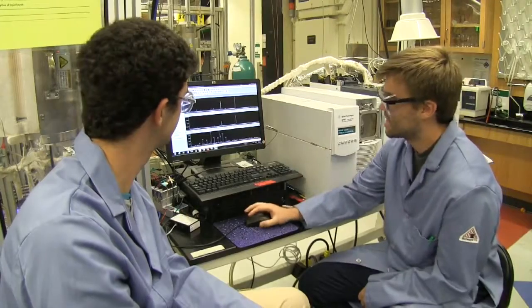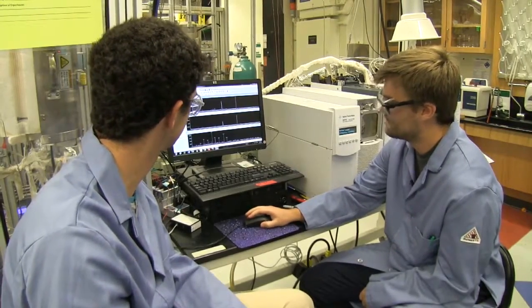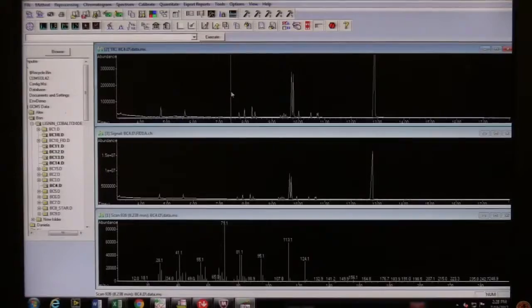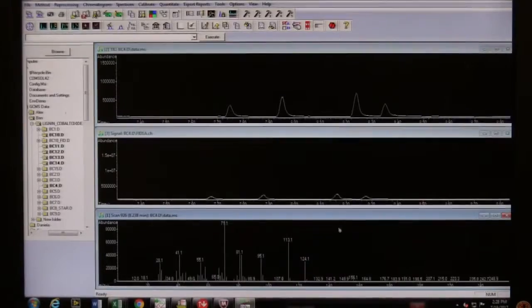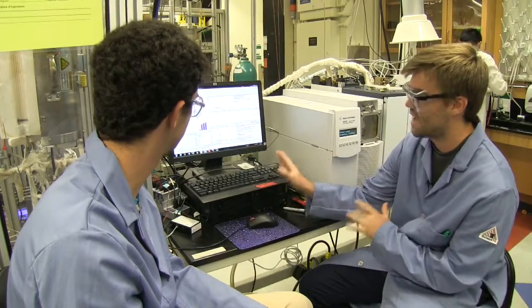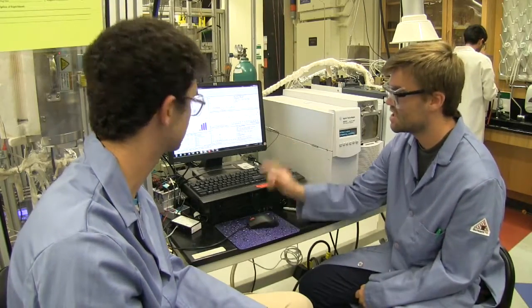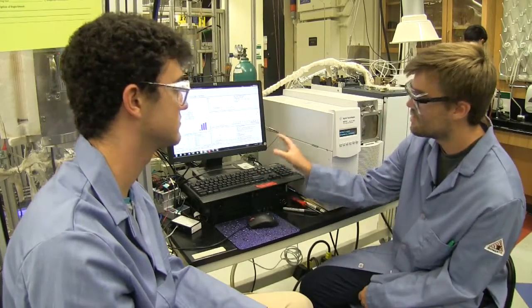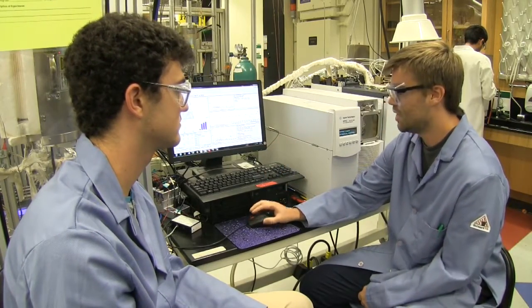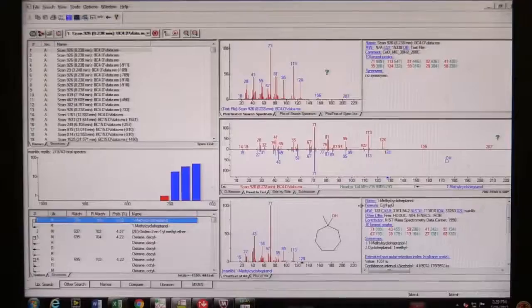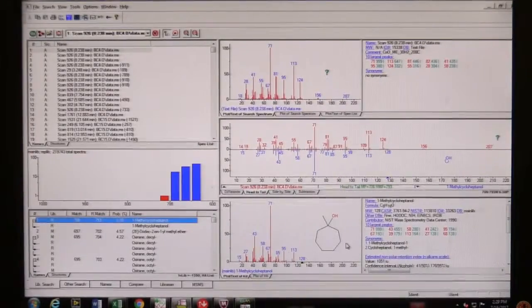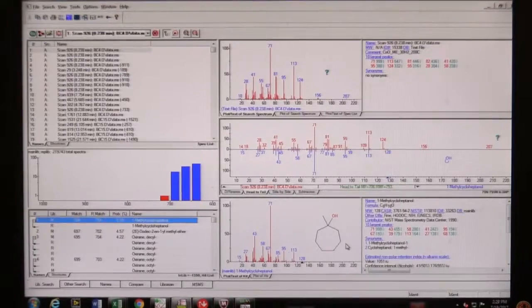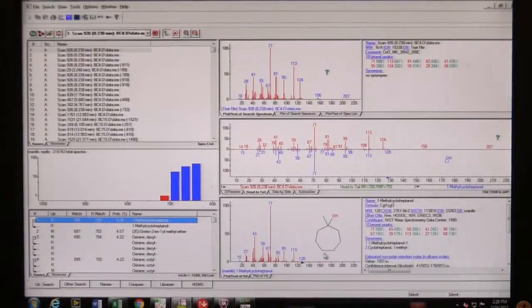So here we have a spectrum and we have all of these peaks corresponding to all of the products that you made. So now if I zoom in on a certain peak, then I can analyze what product that peak is. But now we have to be really careful because this program will tell you it's a certain thing. But we need to think about the chemistry of our reaction and make sure that based on the compounds that we're putting in and the reactions that are occurring, that this product is actually something that could be made.